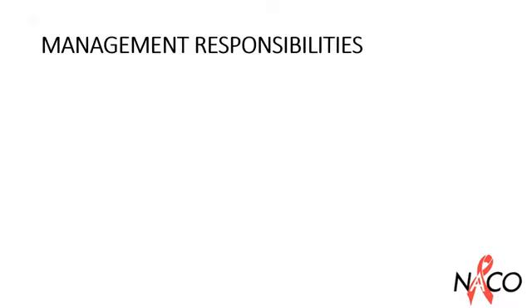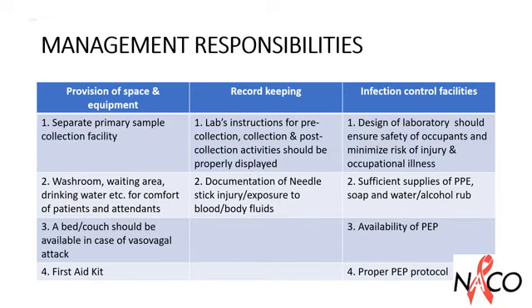Of key importance in pre-analytical activities is to ensure who does what, to define responsibilities and job description of the management and the technical staff. The management responsibilities in primary sample collection include provision of space and equipment, record keeping, and infection control facilities.